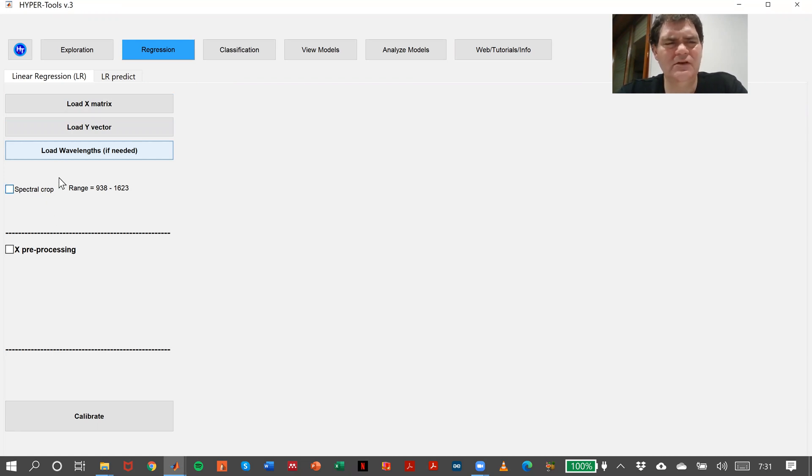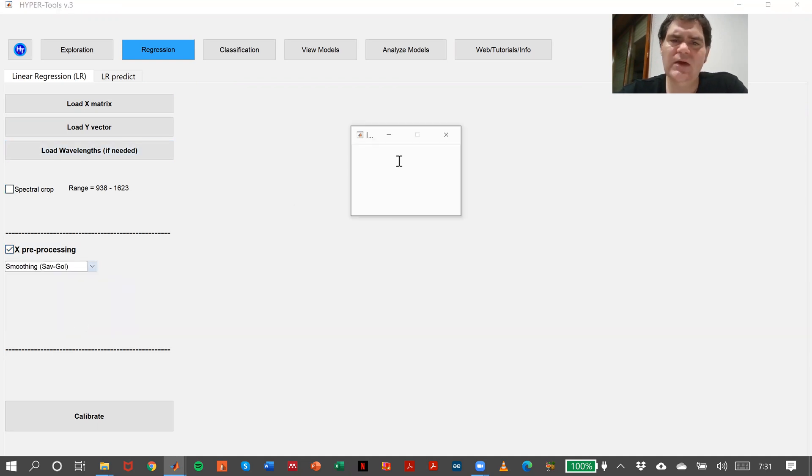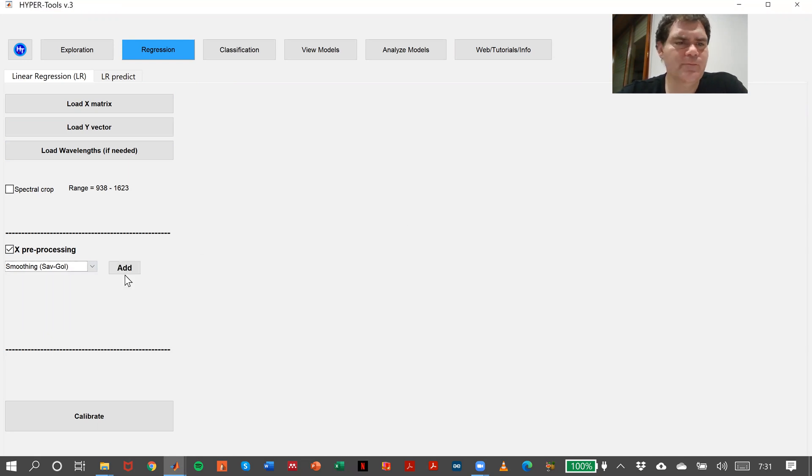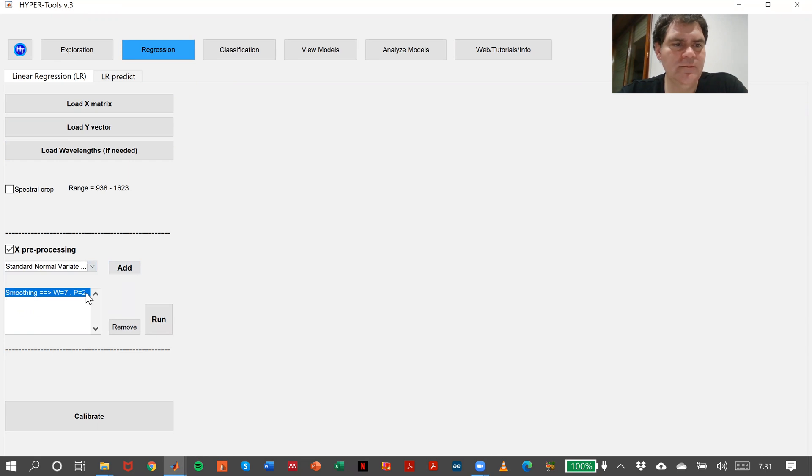We have the same ability of making spectral cropping or preprocessing. In this case, let's apply a little bit of smoothing and SMB.